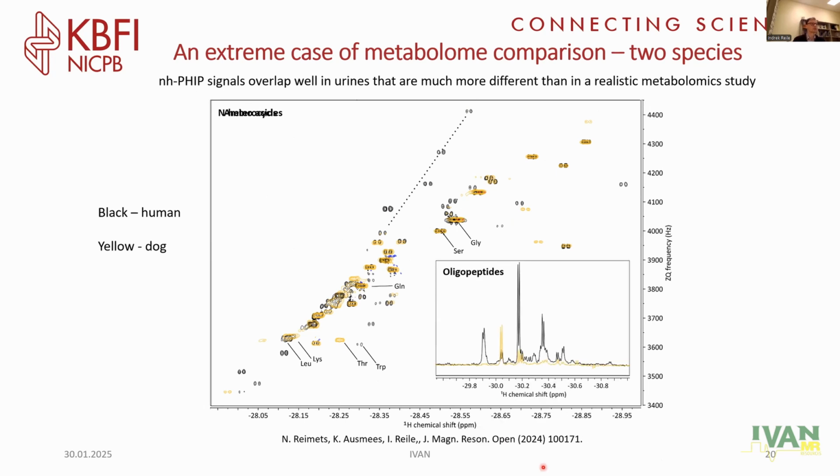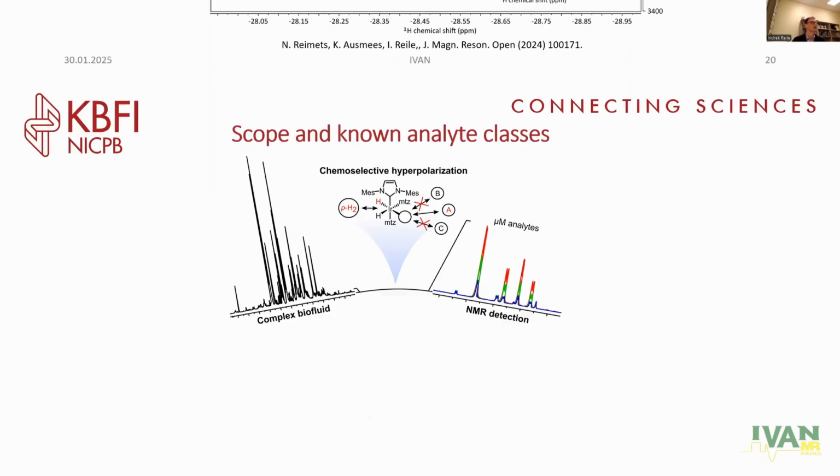And also in those urines, some very weak peptide signals. But of course, you shouldn't be seeing much peptides in a urine sample anyway, unless the patient in question has a kidney disease, but both patients in question were very dear colleagues. So fortunately, we were happy to see very limited peptides in these samples.